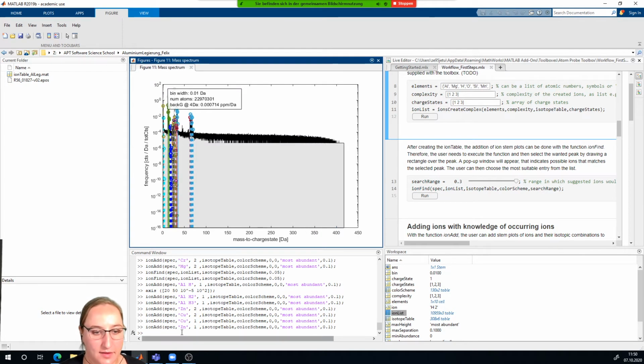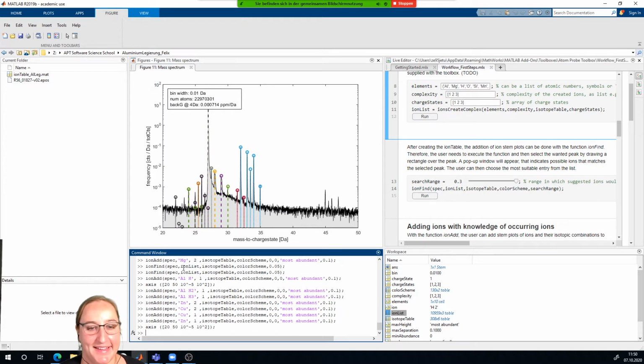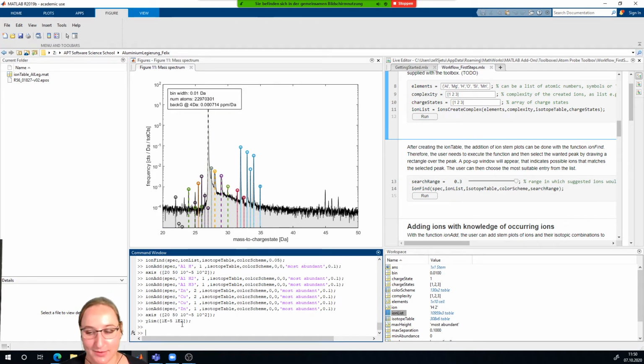On the home button, but then, okay, or also I see Andy London gave another alternative of what you can type in. Thank you very much. I'm also still learning MATLAB.